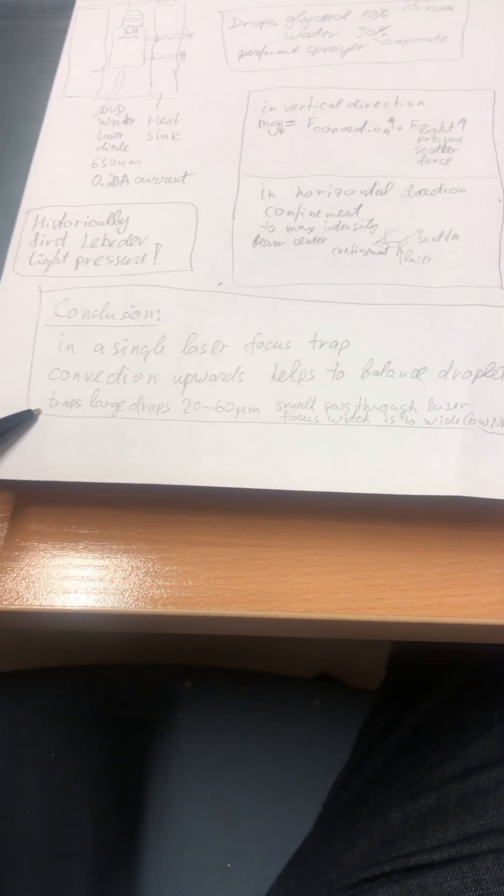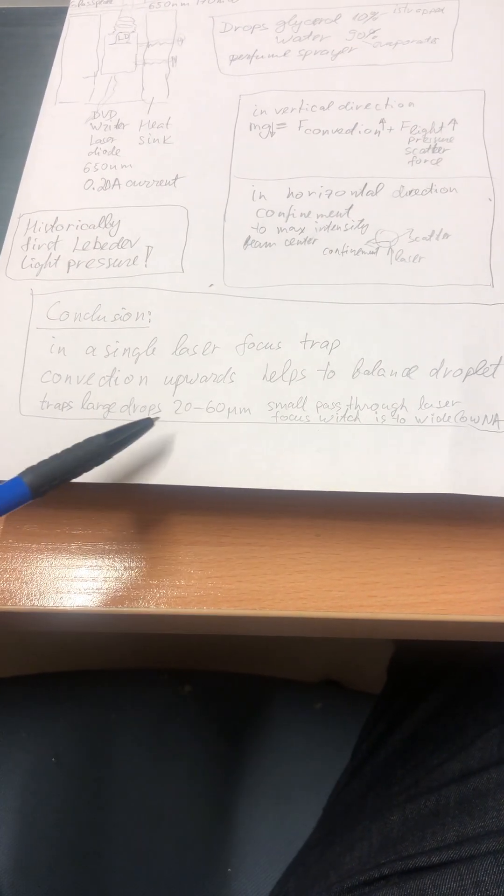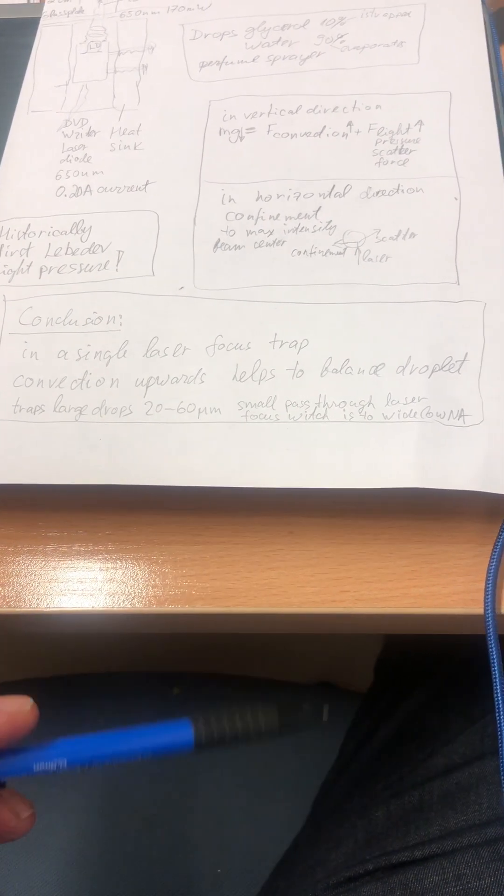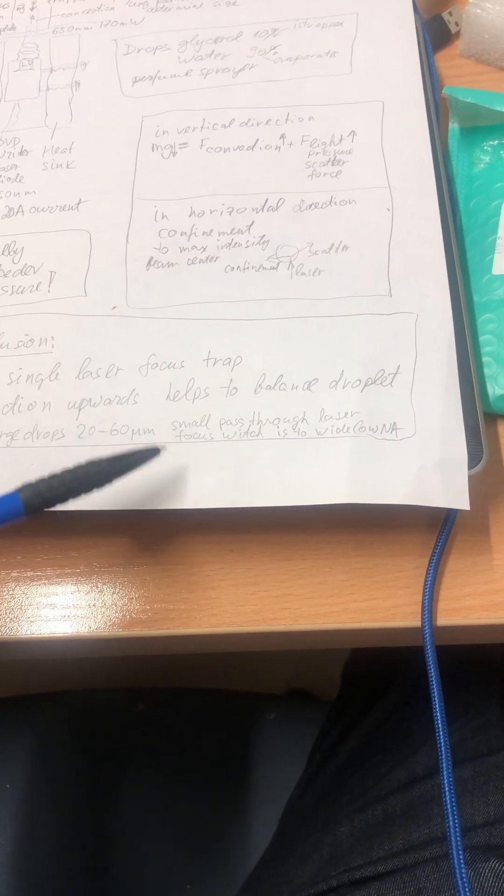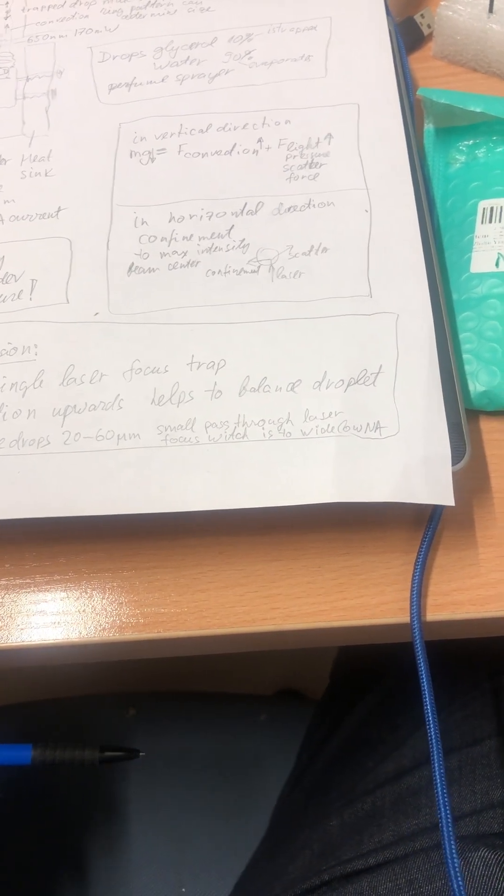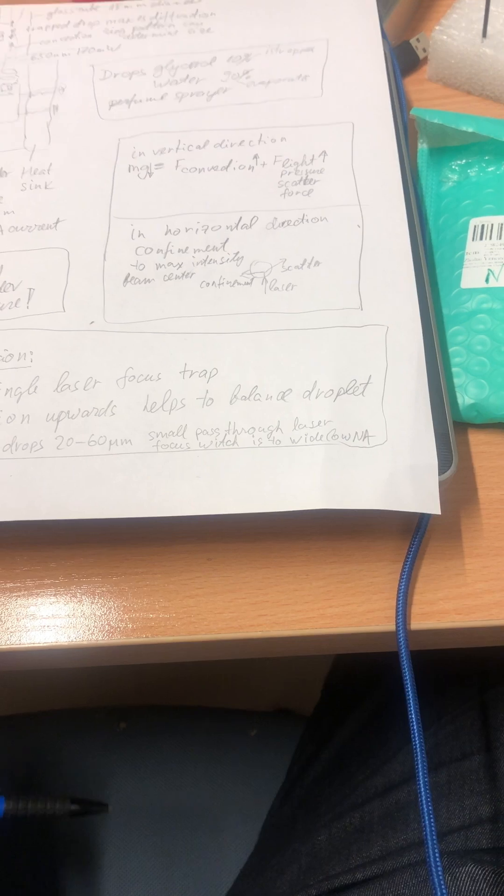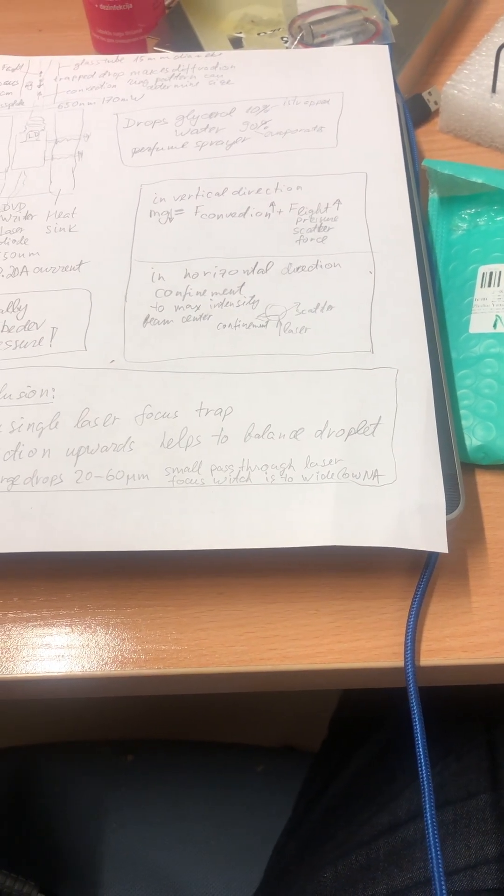The trap is good for large drops, 20 to 60 micrometers diameter. Small drops pass through the laser beam which is too broad for them, and they just see a plane wave.